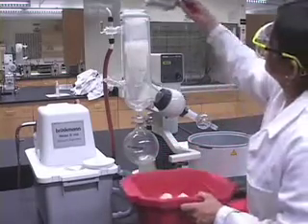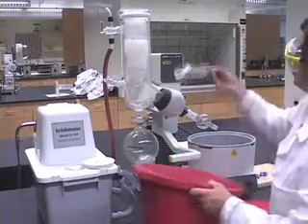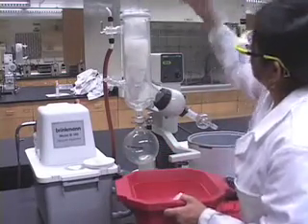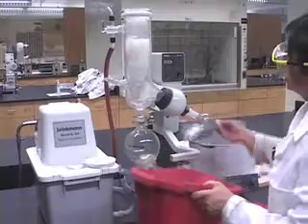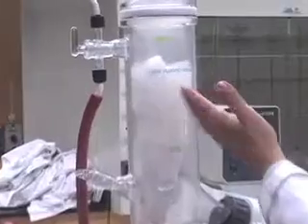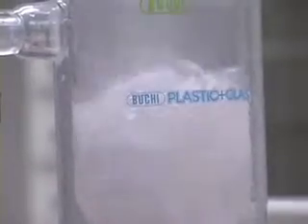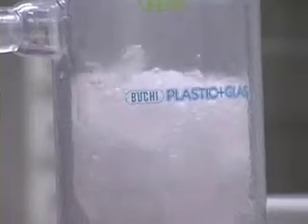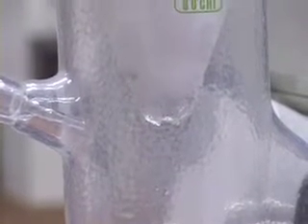So, continue to add dry ice till we have a very cold mixture, as observed in the mixture of isopropanol and dry ice. You notice that you can see the solid dry ice on top. So, I will just add one more piece, and if you have a mixture which looks like that, where you see the dry ice and the isopropanol boiling, then we have added enough dry ice.